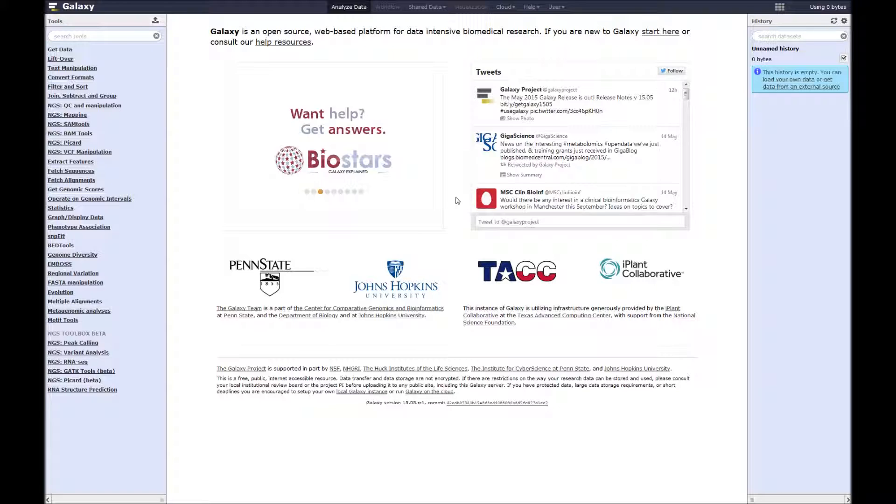Let's take a short stroll around Galaxy. This is the main public instance at usegalaxy.org. If you have not already done so you can register with them. If you go to the user menu at the top you can select register. The main advantage of registering is that any work you do during a particular session will stay with your user account and will be available the next time you log in. So I recommend you do that.